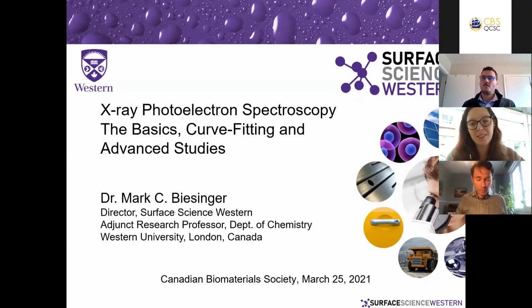So we thought that it would be very interesting for our pool of students who are users of XPS for the characterization of biomedical surfaces, essentially. So Mark Biesinger authors and maintains the X-ray photoelectron spectroscopy reference page, which is a repository of techniques, tips, and reference materials designed to help XPS users worldwide. So we invite our students to have a look at his webpage and all the information that is contained in there.